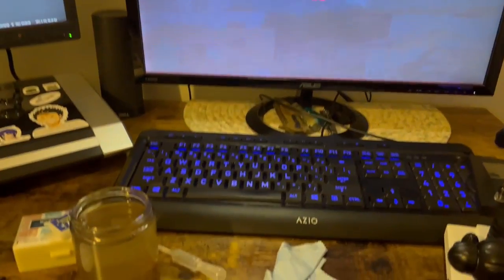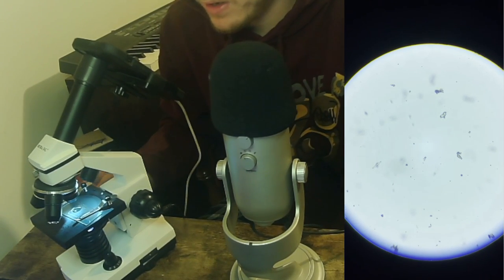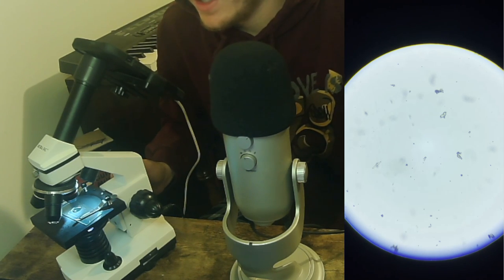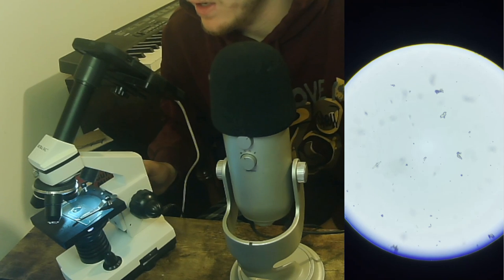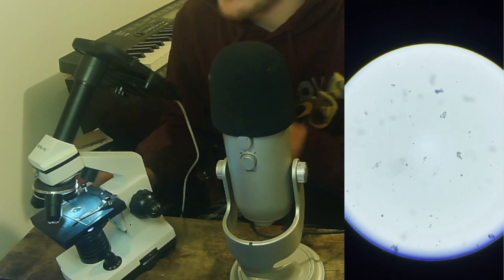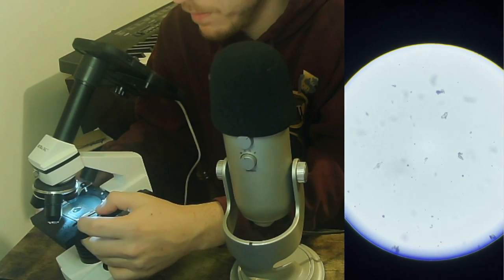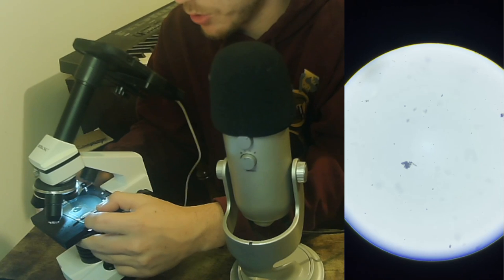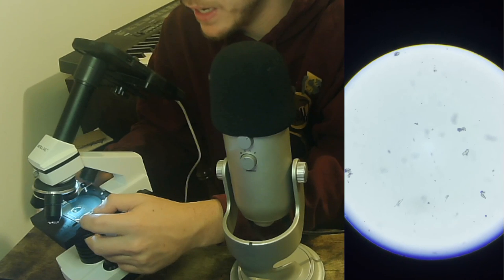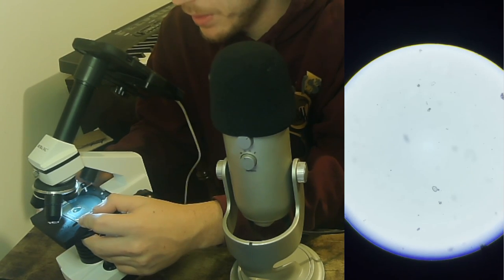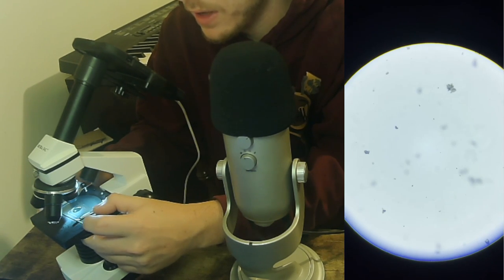All right, welcome to microscope mode. So what you're seeing on the side now is what I'm seeing under the microscope in this current moment. I've just got the phone hooked up to the microscope so I can see what's going on. This is at the very lowest zoom. You can see there are some discernible figures. This little thing right here might be a diatom. This is probably some sort of ciliate right here, something that has cilia, something it can move with.